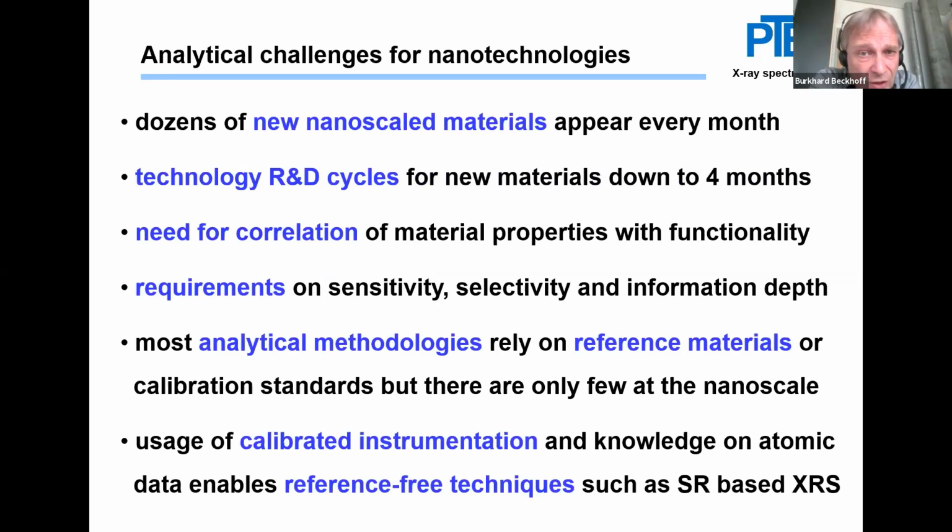So the key motivation for us, or a starting point for us, for TXRF was analytical challenges related to nanotechnology. You have dozens of new nano-scaled materials that appear every month. Technology R&D cycles are down to 3 or 4 months, and this requires, on the R&D level, but also on the quality level, the correlation of the material properties with the functionality.